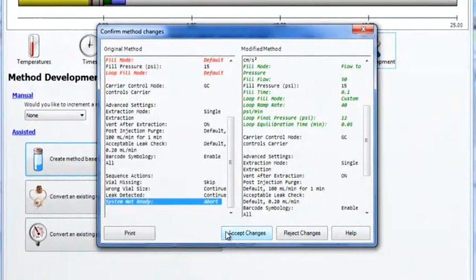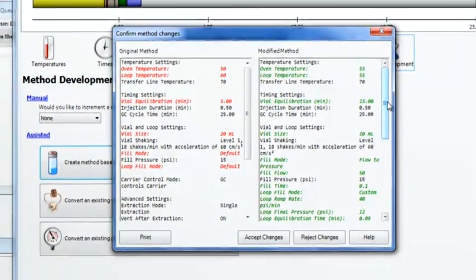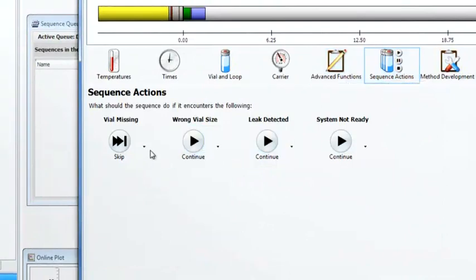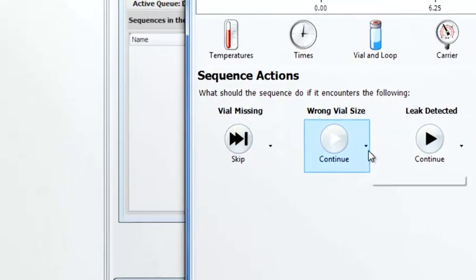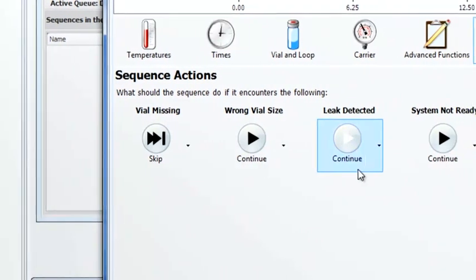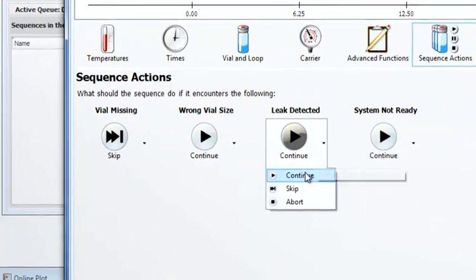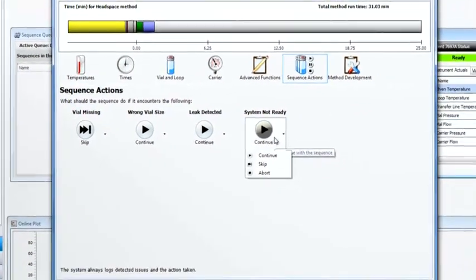The software guides you step-by-step through the method parameters with a familiar interface layout. The Sequence Action screen lets you specify courses of action for situations such as missing vials, unreadable barcode labels, or incorrect vial size. This allows you to adjust the 7697A Headspace Sampler to meet your workflow requirements.